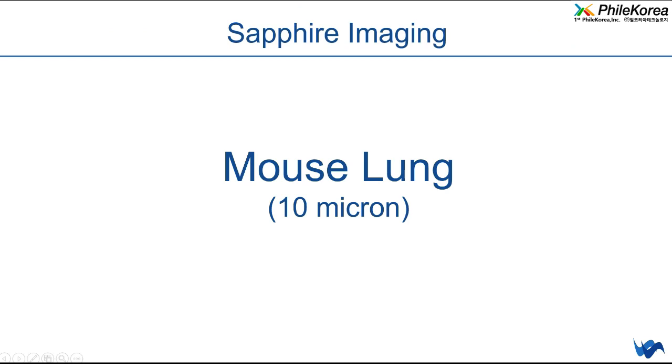This function of moving the scanning head up and down is very interesting. We call it Z stacking. We are also working on making this automatic, so that we push a button and the machine will generate Z stacks automatically. But also what is interesting to know, the 800 laser, the near-infrared laser, has the possibility to penetrate this tissue. So you don't even need to clarify it. When you combine tissue which is not clarified, and we use the 800 nanometer laser in parallel with, for instance, the 488, then you get nice overlays.